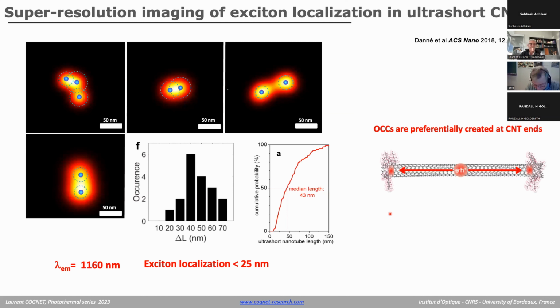So now we're applying these ultra-short carbon nanotubes to brain imaging, and it works pretty well. We can even access regions of the brain that longer nanotubes cannot access. So we are writing the paper at the moment. But it's really interesting to have ultra-short carbon nanotubes that emit at 1200 nanometers, and we excite them at 985 nanometers. 4 minutes left, no? Okay, I will be done.